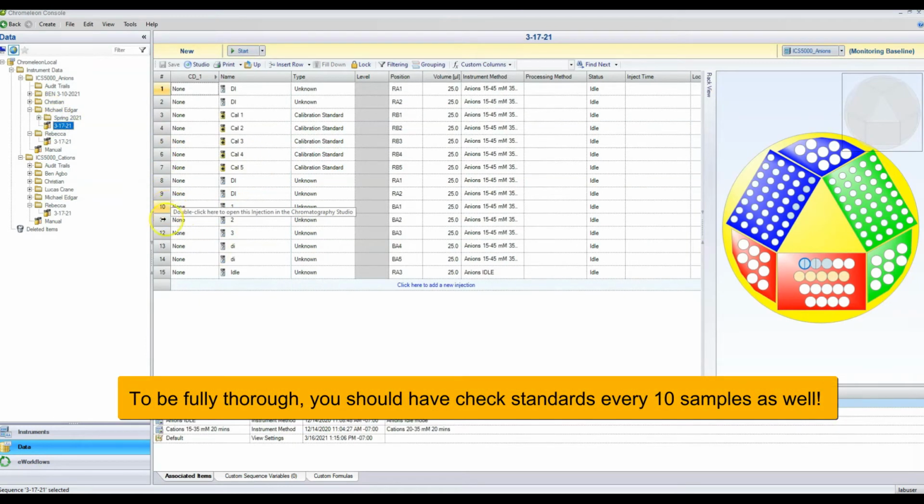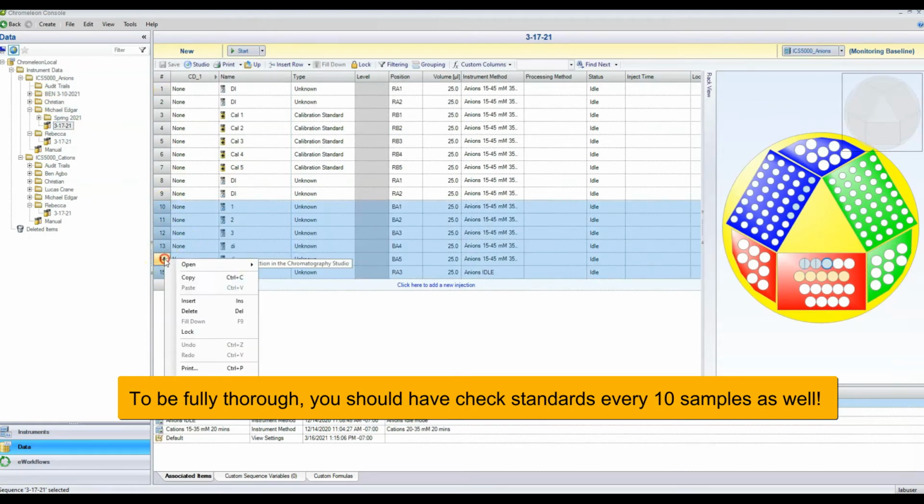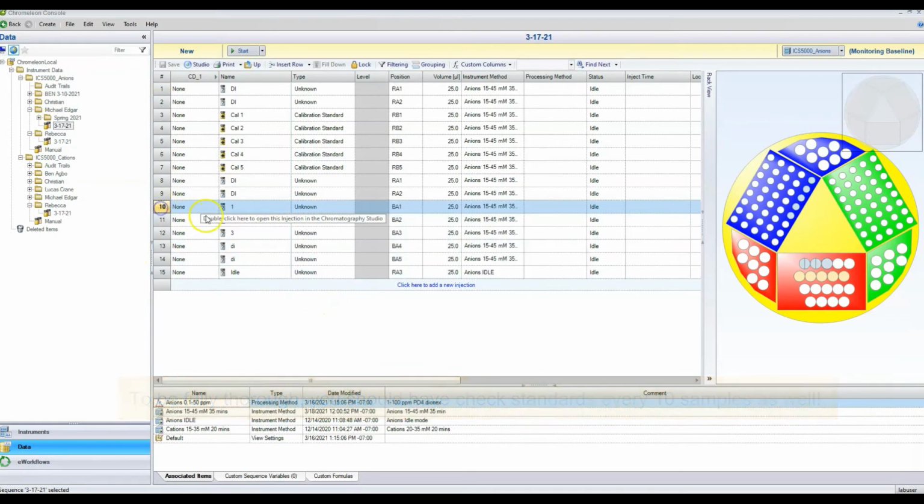So you can also just copy entire segments. You can just copy and paste that in, whatever way you find is easiest. Anyways, once you get all of your samples in there, or enough spaces for your samples and you've got them in the right orders, you can change the names. For me, I'm just going to name them 1, 2, and 3. This is completely fine with me.